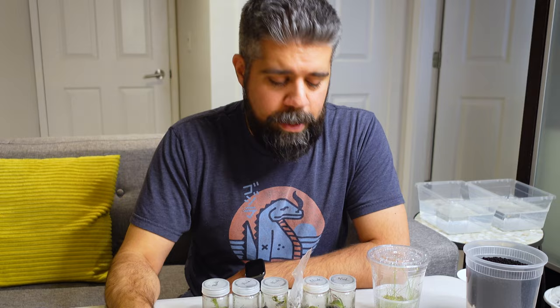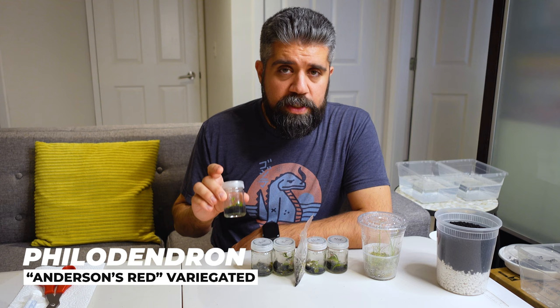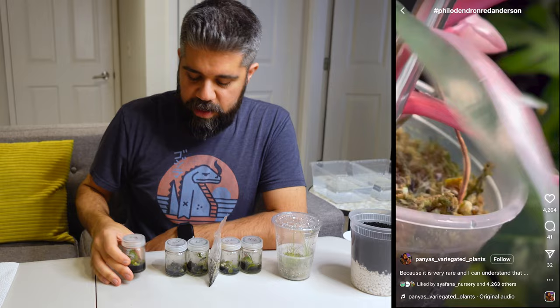I have five Philodendron Red Andersons. The Red Anderson is a hybrid between the Philodendron Pink Princess and the White Knight — I'll double-check, but I'm pretty sure that's what it is. I'll show you a picture of what a mature one looks like. Here's one of the better ones currently in the flask — you can see it looks pretty good, with a little bit of variegation starting on one of the taller leaves. I'll give you a close-up when I open the individual flasks.